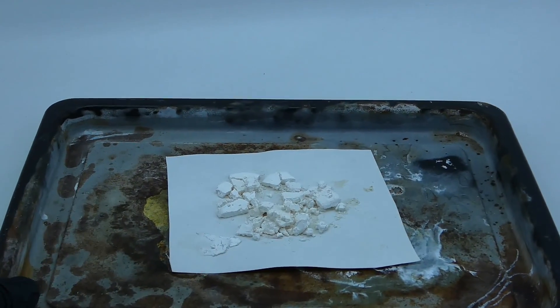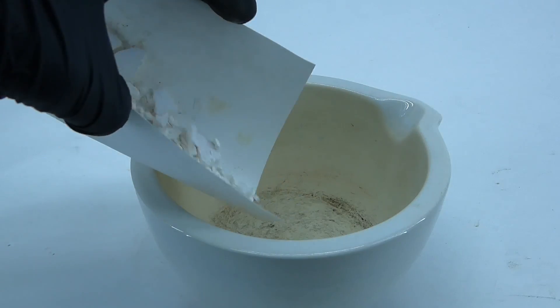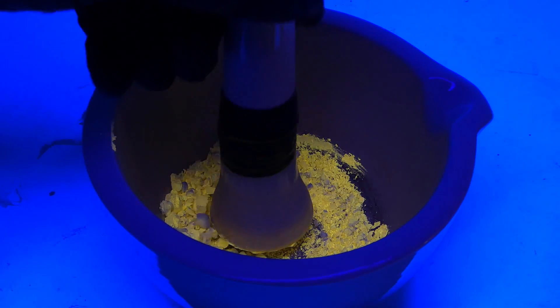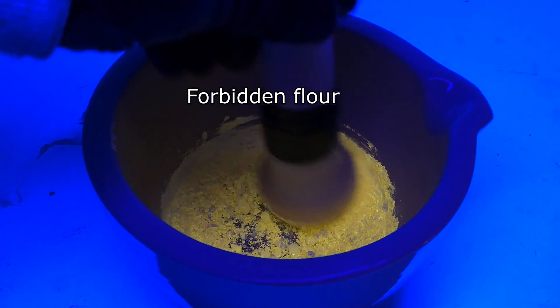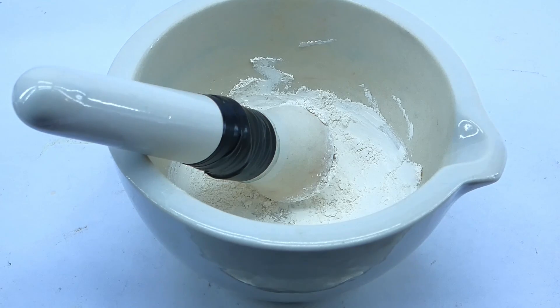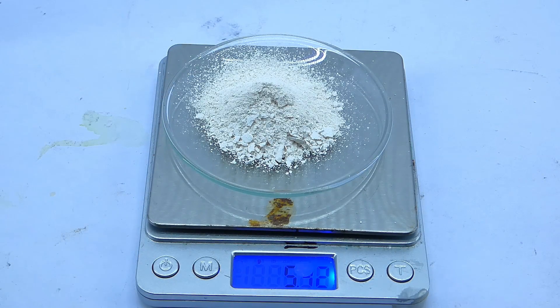I took it out of the oven, and now it was time to crush it into a fine powder. To do that, I used my trusty mortar, and under UV light, the grinding looked very nice. After I was done, I was left with a lot of a very fine white powder, which I now wanted to weigh to know how much I have. It turns out that I have about 5.4 grams of it, which is a pretty nice amount.